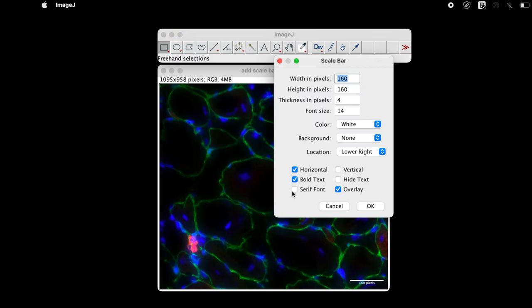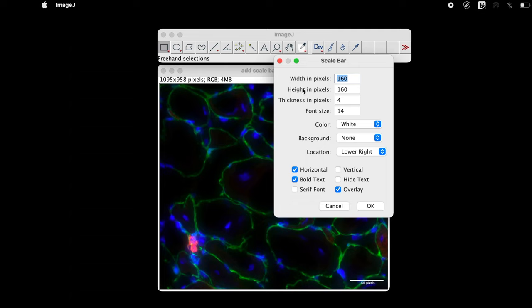The scale bar dialog box presents a list of parameters. Let us discuss one after another. At this point there is a scale bar at the lower right of the image. The first parameter discusses the width in pixels.